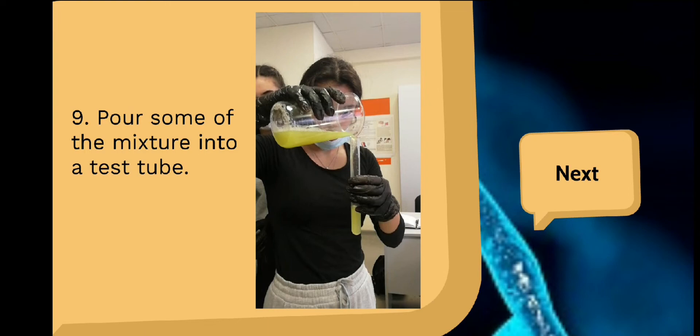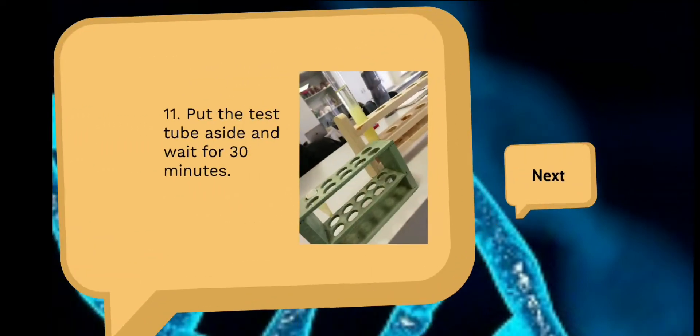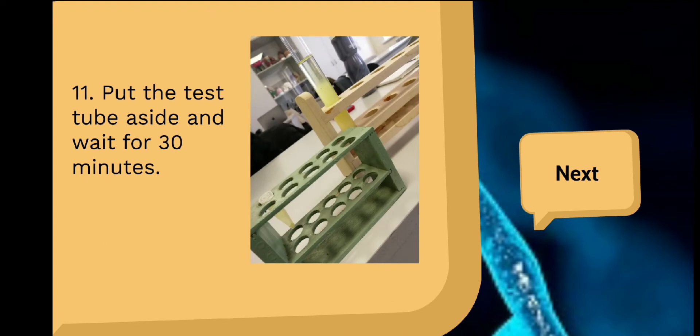Pour some of the mixture into a test tube. With the pipette, add 10 ml of ethanol to the test tube. Put the test tube aside and wait for 30 minutes.